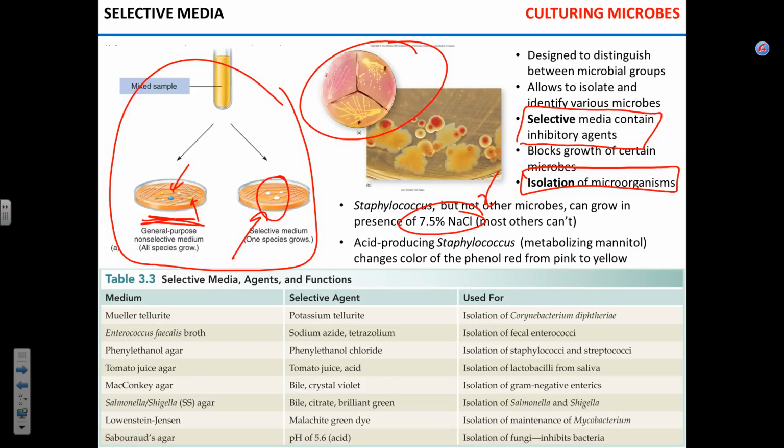And then some of the Staphylococcus species can use the sugar named mannitol as the source of energy in the process of fermentation. Others cannot. So if Staphylococci ferment mannitol, they produce yellow colonies. If they don't ferment mannitol, the colonies will appear red. Does that make sense?